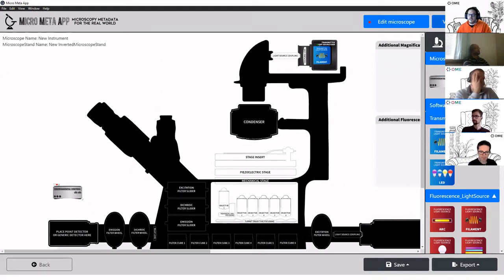An additional thing is that you may want to have all the fields available, but you are not able to fill them all in this session. You can lower your validation tier here. So you basically can have a full list of components, but try to validate for a lower tier, and it requires basically to insert less information and still have a valid setup based on the model that we are using.